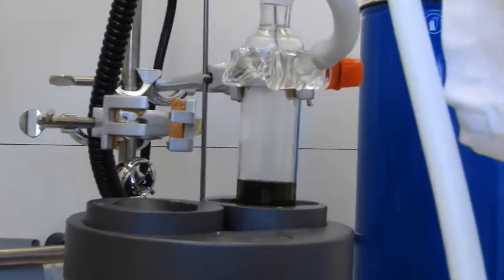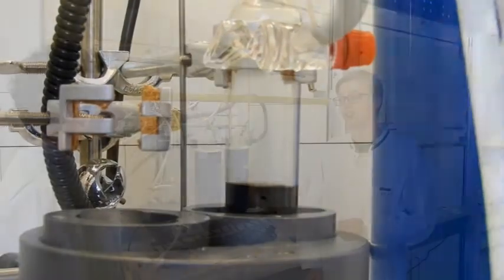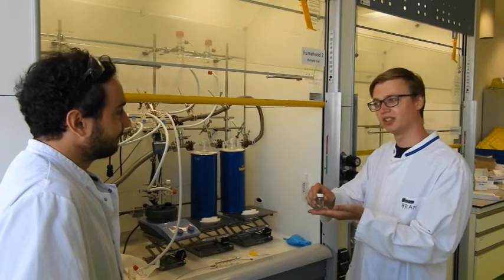Now this is black, indicating we have metal colloidal nanoparticles. Now that I've shown you how I make my metal nanoparticles, if we deposit them on the support, we can actually use it as a catalyst.